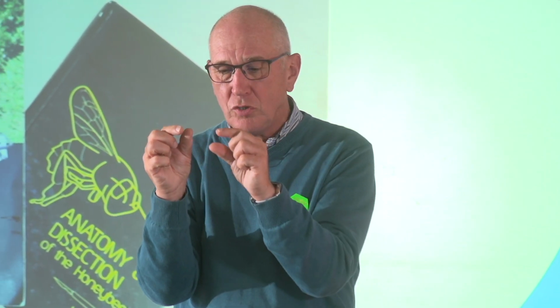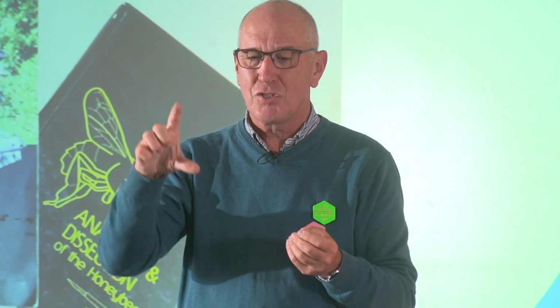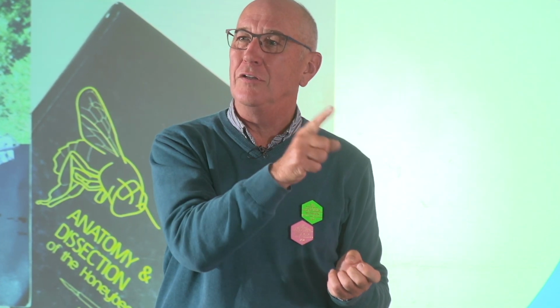With the tweezers, you have to make sure they've got very good fine points to actually do it. If you're getting the scalpels and the blades, you have to be over 18 to get the blades, so if you can get them off the internet, they're very, very cheap. If I was starting, I would start by buying individual bits which are of economic value, and only if the interest is there and you want more detail do you spend more money.